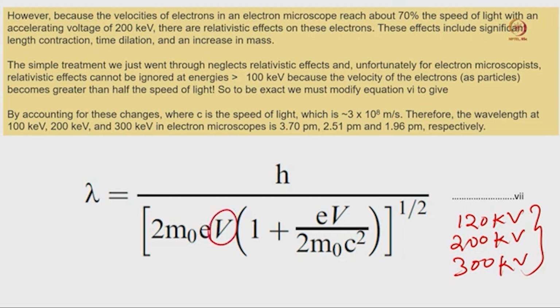If we remember, last class I also discussed that lambda is inversely proportional to the square root of the voltage.